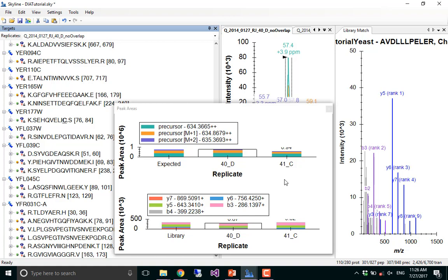When it went up? Did it have heavy labels included? Let me see. That sounds like a dump, which makes me think that it's included heavy, if you just look at the templates. Multiple people have it? Alright.